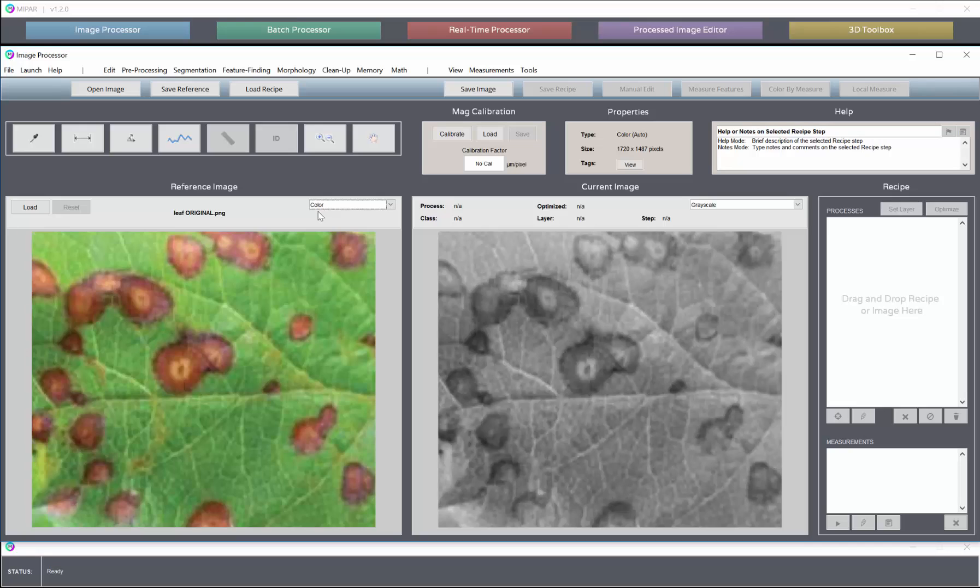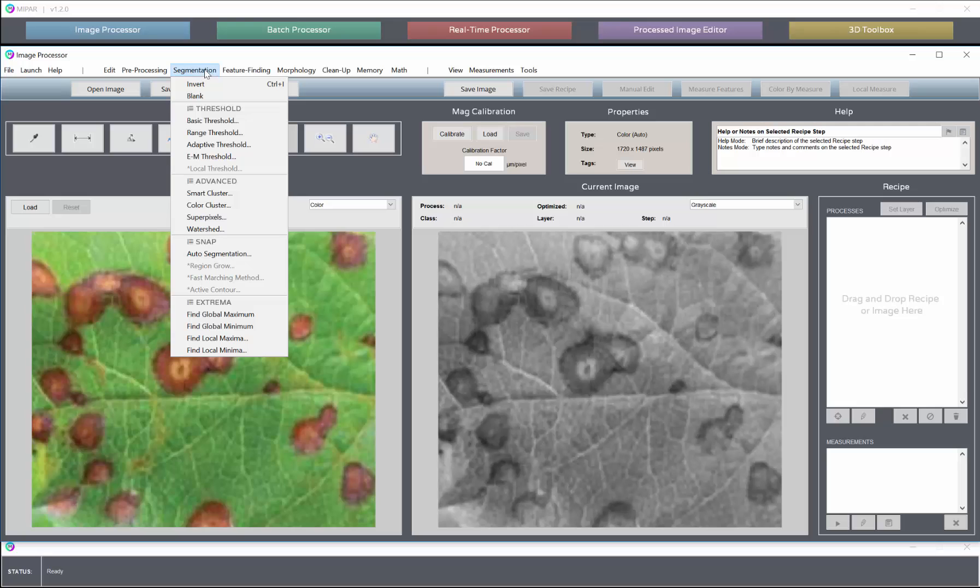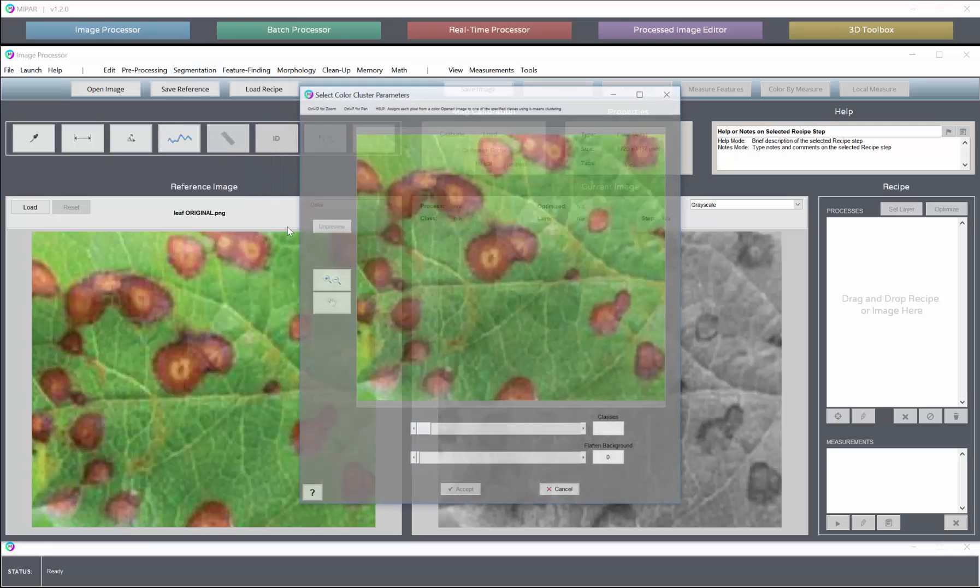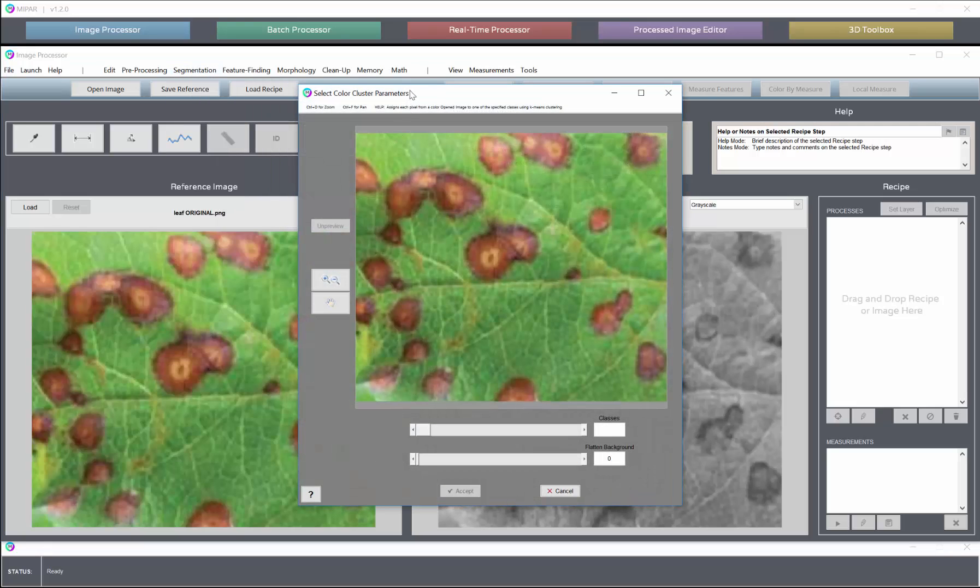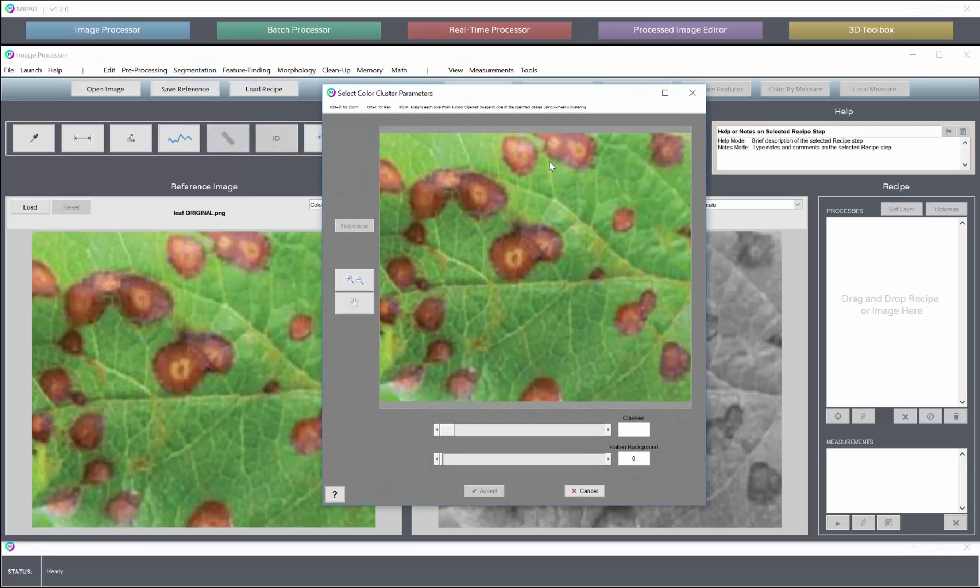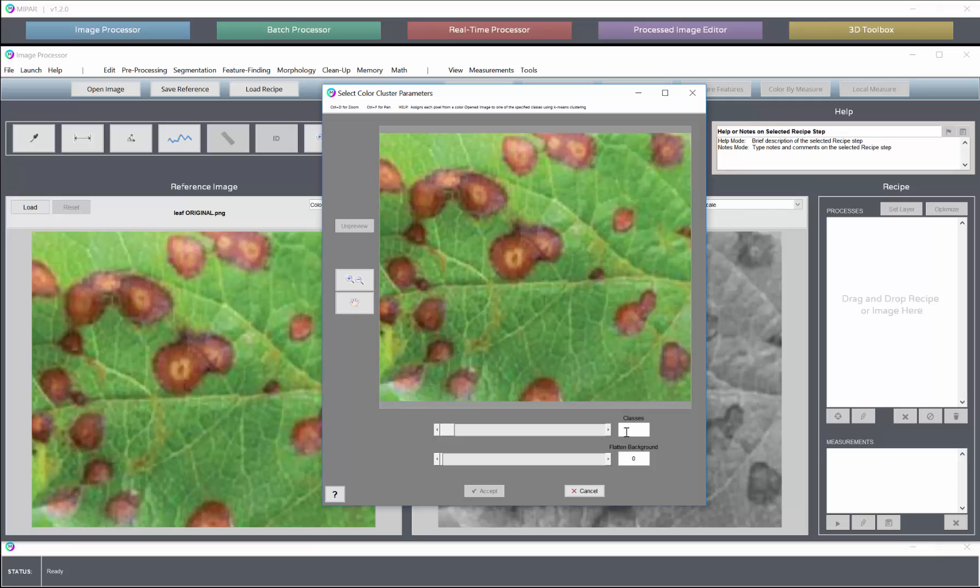But we can still do plenty of powerful things with that. So from segmentation we can go into color cluster, and here we can choose how many classes we like to split the image up into. If I type in two, we will do exactly that.